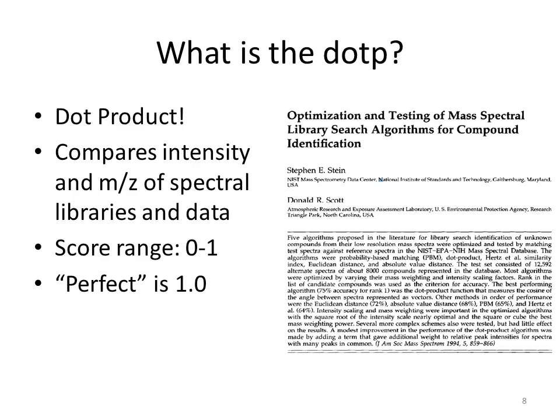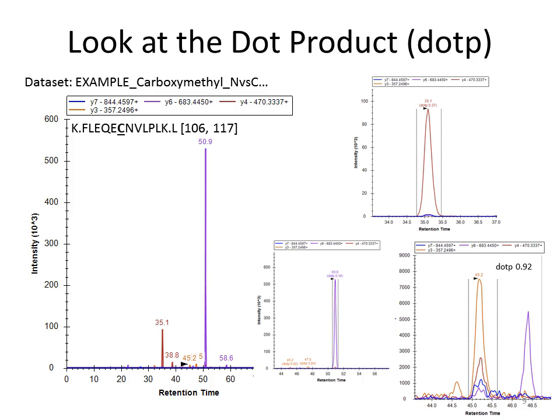So that's why dot product works: the data are broken down into mass to charge with an intensity value, and then it just compares that to what you get on another instrument. And as long as you're within the linear range of detection, it should match and it should be great. If you're below that, then those ratios do not work so well. And I have more details about that if anyone's confused. But here is pretty much how the dot product works.